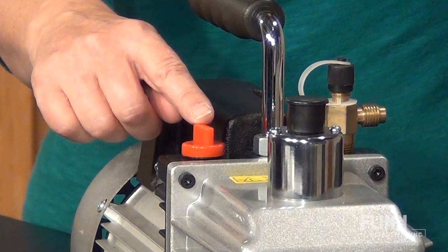It's a good idea to drain the oil at the end of the school year or any time the pump's not going to be used for several months. Be sure to add fresh oil before you use the pump again.